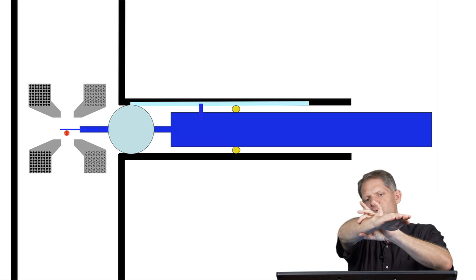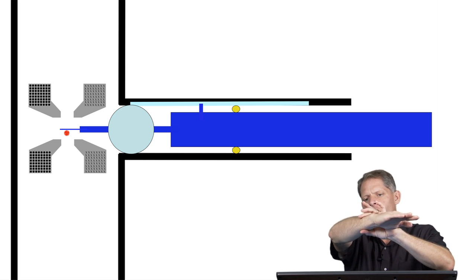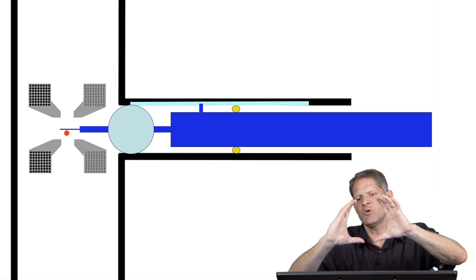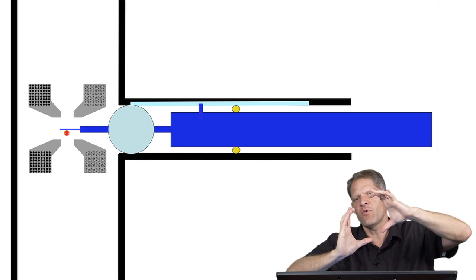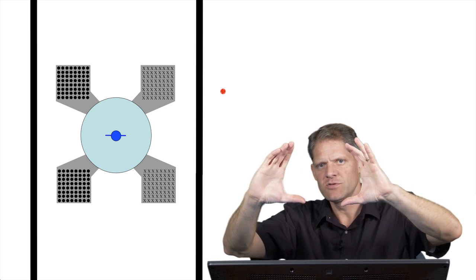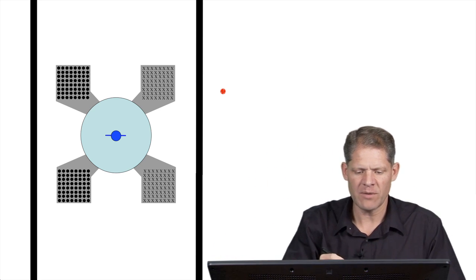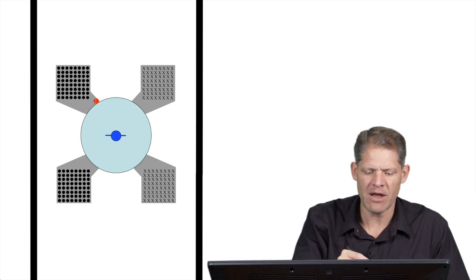Now this allows the specimen holder to be moved both out and in within the goniometer. It can also be tilted up or down, braced by that O-ring, and also left and right, all within the goniometer tube, which can rotate back and forth to tilt the sample. Now if we were to rotate that view, so we were looking straight down on the specimen, this is what I'm trying to depict in this diagram here.